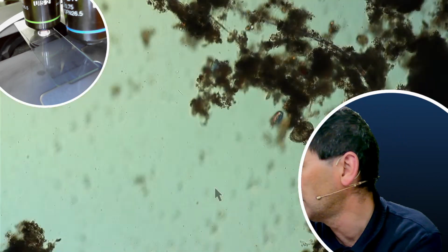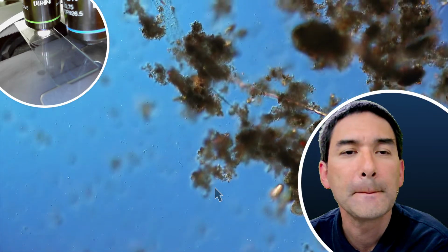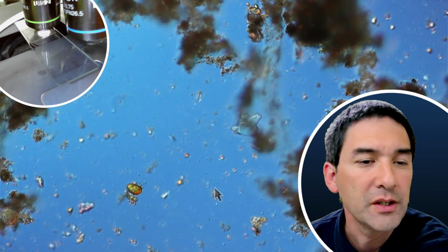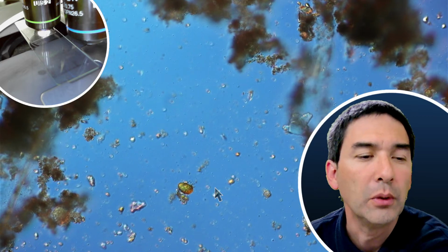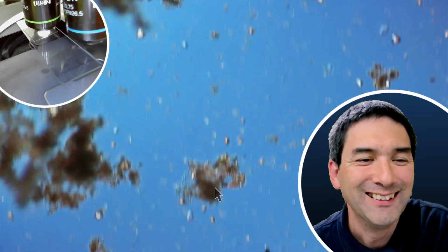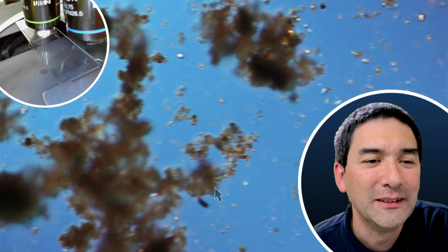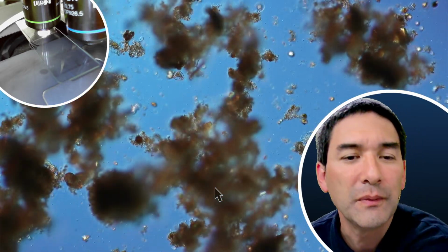Let me adjust the other filter as well. I've also seen a little bit some fungi as well. This here, for example, could also be a pollen. I bumped into the stage. Now it's gone. Okay, let's give it another try. So plenty of things to observe.